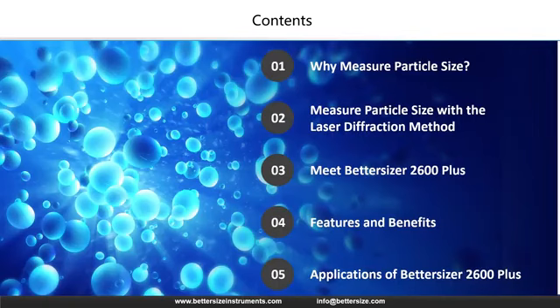Our discussion today is structured to take us from the fundamental why to the practical how. First, we will step back and answer the core question: why measure particle size? Why is this parameter so critical to your product quality? Second, we will look at the physics. We will explore how we measure particle size using the laser diffraction method, establishing the scientific principles that drive our technology.